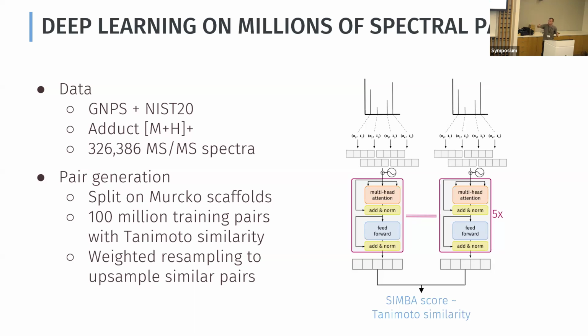So most of these approaches, like MS2 Deep Score, use one Dalton bins. So unit resolution, the data size becomes more manageable, but you lose your accurate fragment mass information. In contrast, the transformer neural network uses a positional embedding approach to directly encode the m/z values at their native resolution without having to bin them. And that's one of the aspects where it's much better.